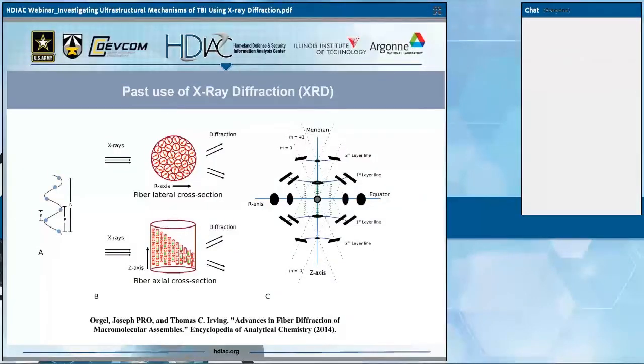So as Jason alluded to, diffraction that's collected from materials that are both biological and not necessarily crystalline have a tendency to give at least some kind of insight, some kind of information into how the material is put together, even if it is, as I already said, non-crystalline, such as you may well find in the organization of biological tissues.